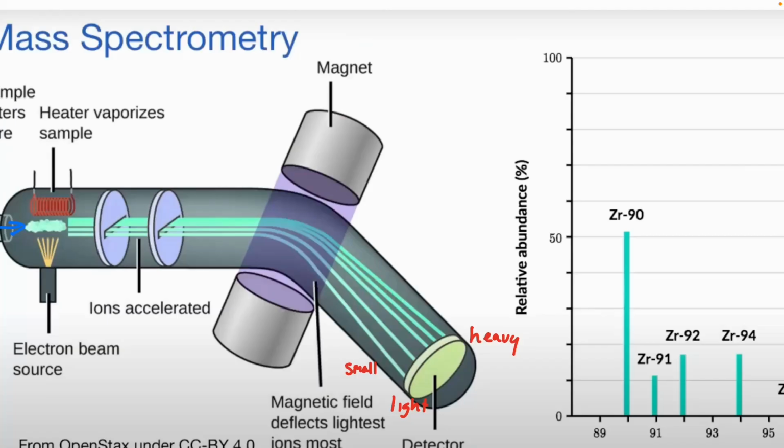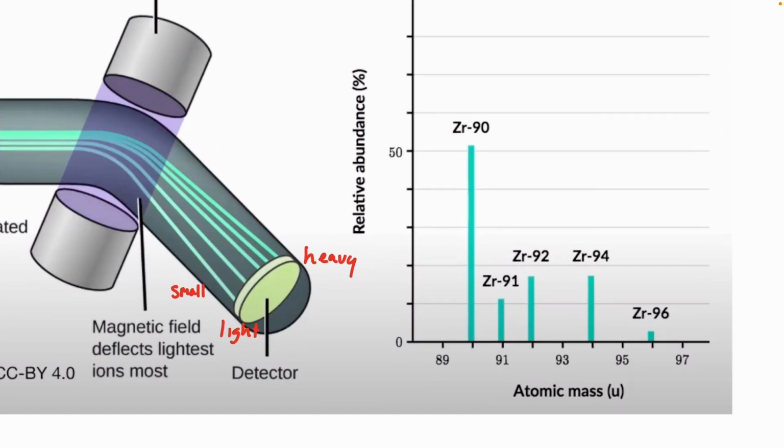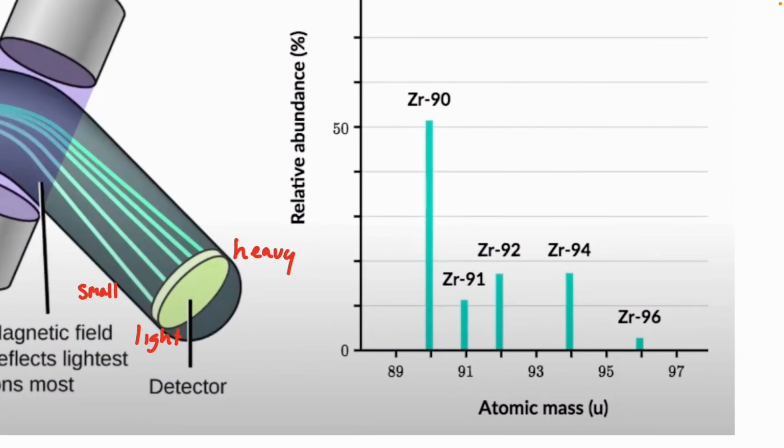All right? So what happens is we get, at the end, this sample of zirconium here that was passed through, and you can see it can differentiate between every zirconium isotope. These only differ by a mass number of 1, right? And I can tell the difference between all these different isotopes depending on where they're hitting on my detector.